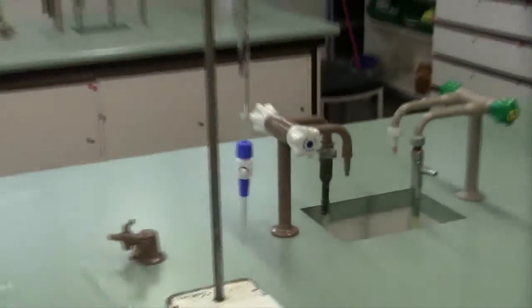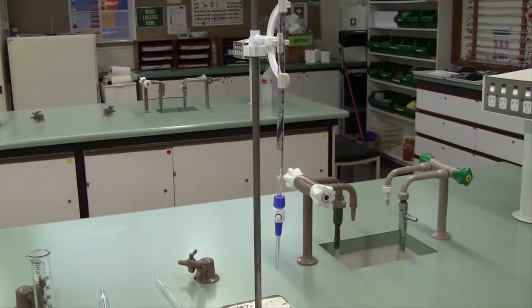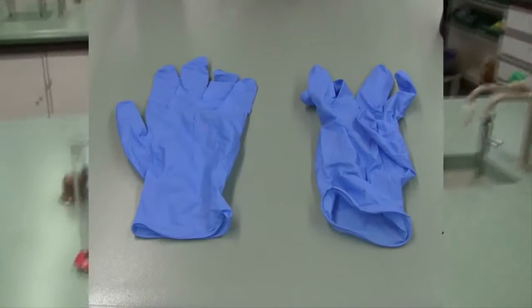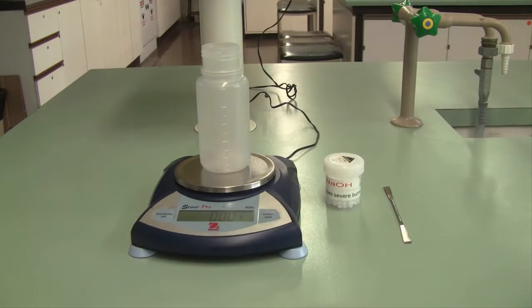Today's experiment will give you an opportunity to recap all of your key laboratory skills to make sure that they are of the highest possible standard. You'll be working with concentrated acids and bases in this lab class. Make sure you're wearing the appropriate safety equipment, including gloves, when necessary.